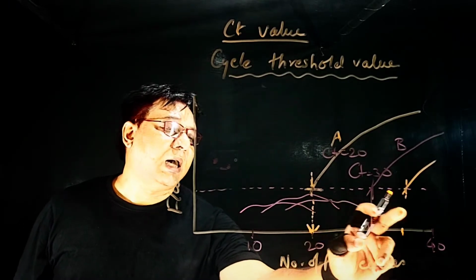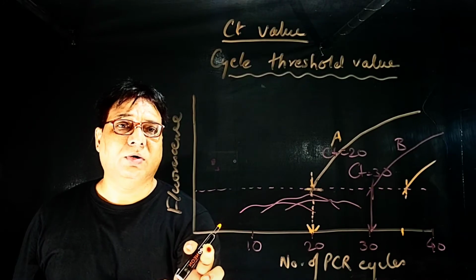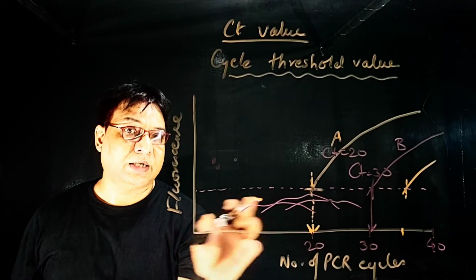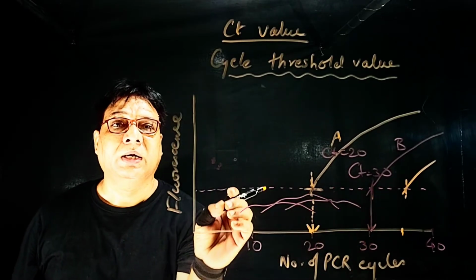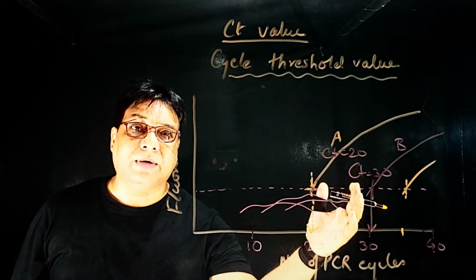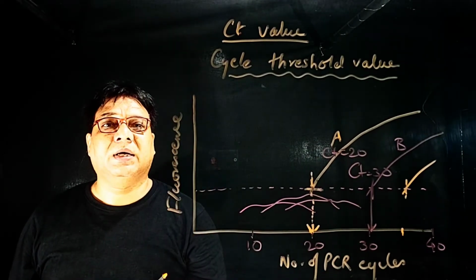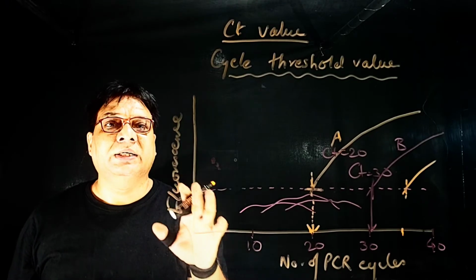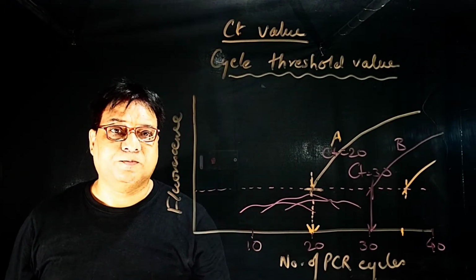So, if this is high, 35, that means a very small amount is needed. It is a matter of concern that even after 35 cycles you are saying that the case is negative. After 35 cycles, which is too much, that means even a very little amount of coronavirus intake is dangerous. It may cause infection.